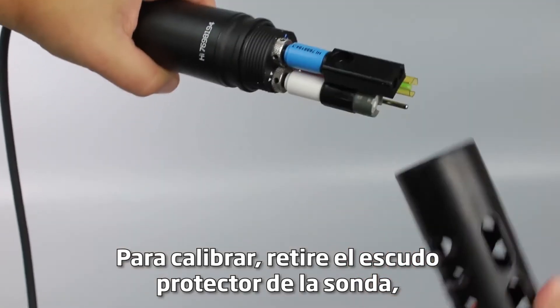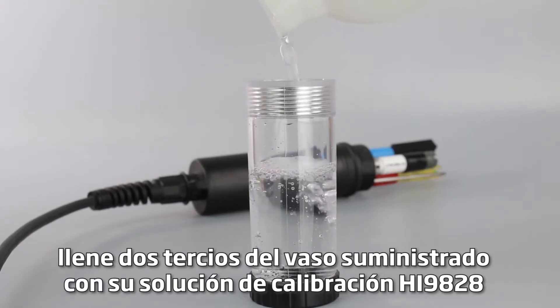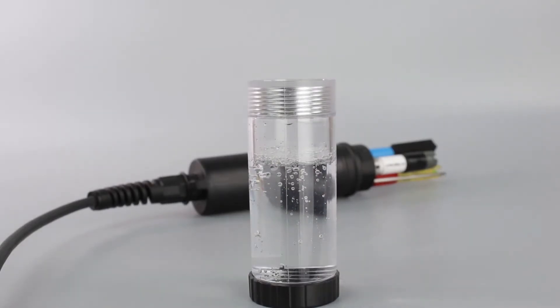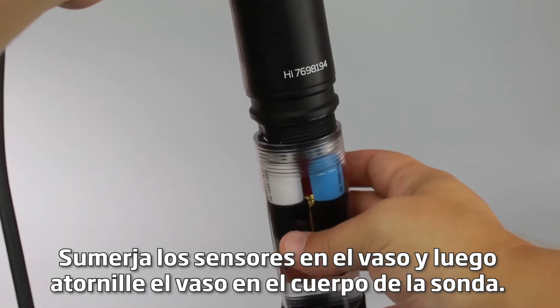To calibrate, remove the protective shield from the probe. Fill the supplied calibration beaker two-thirds of the way with your HI-9828 calibration solution. Submerge the sensors into the beaker and then screw the beaker onto the probe body.